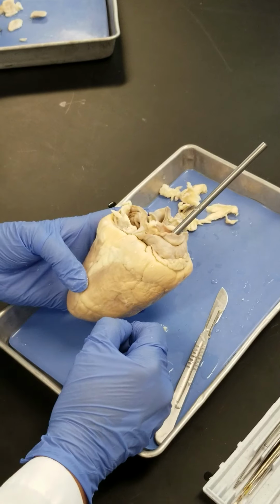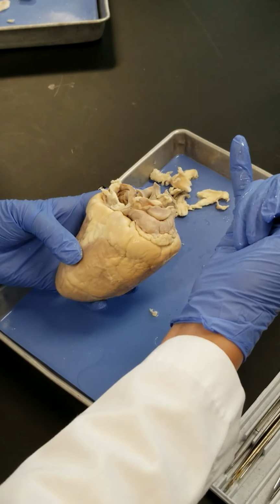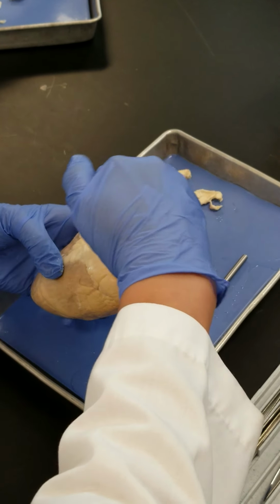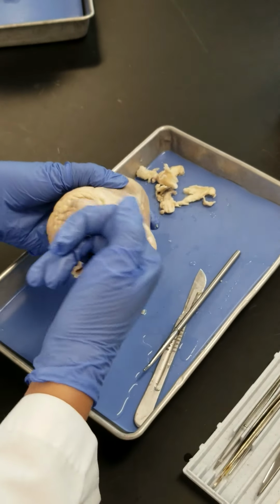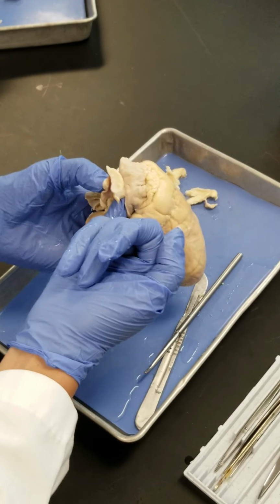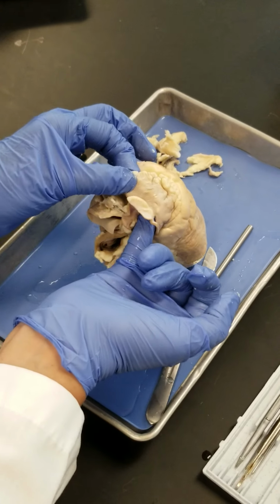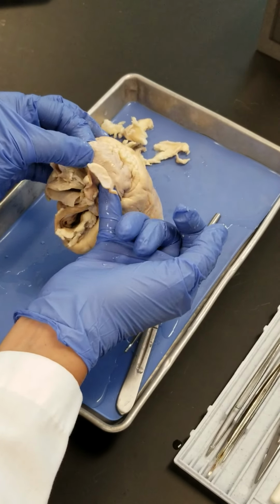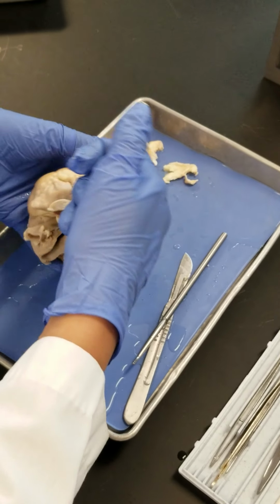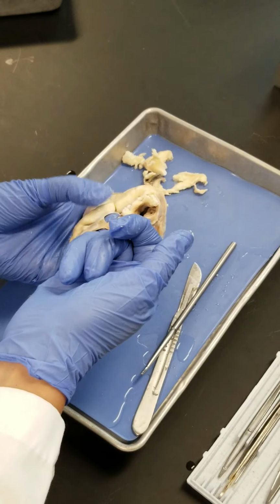You can use your fingers. Put your finger into this cavity. This is the right atrium, and remember, you can open the auricle here. You see how the auricle can get separated, both sides of the auricle, and can accommodate more blood when it is needed, right? So go around and search if you can find another opening here.